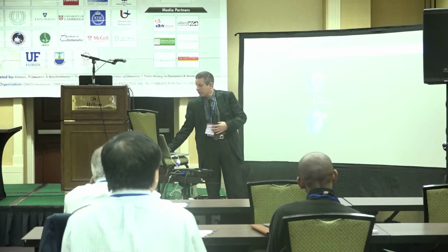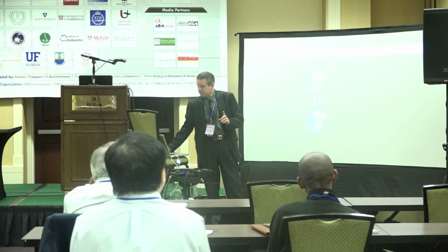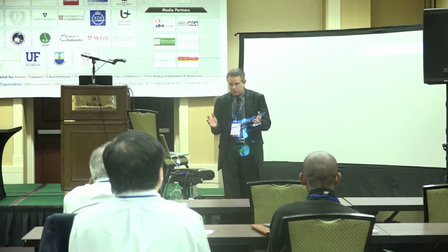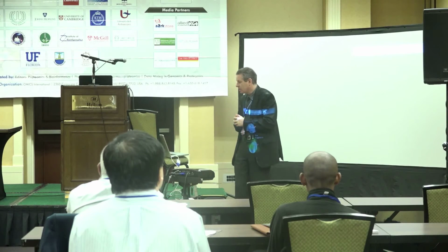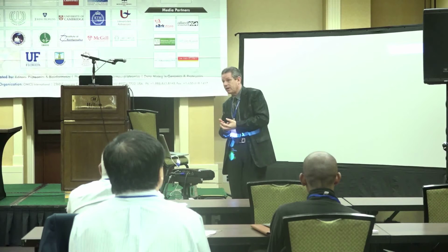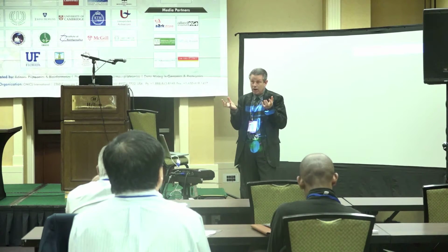So where we're going now with this is that in principle, we have about 3,500 measurements per antibody microarray. However, there's no reason why we can't go to a double labeling process.